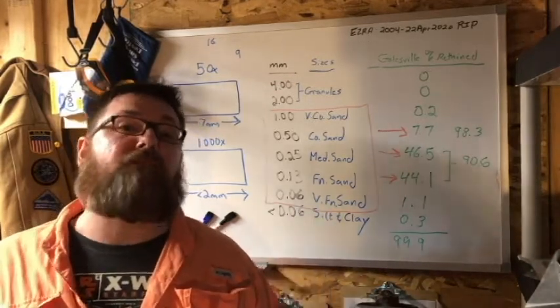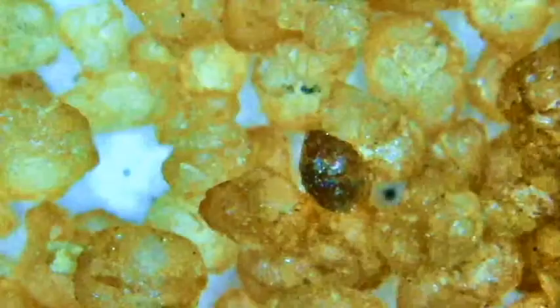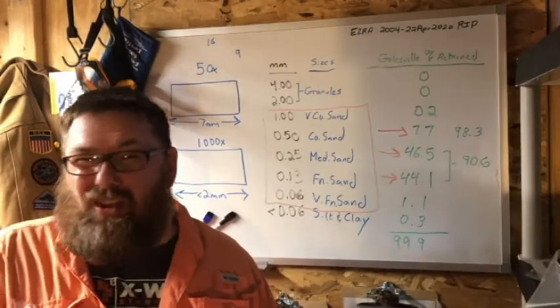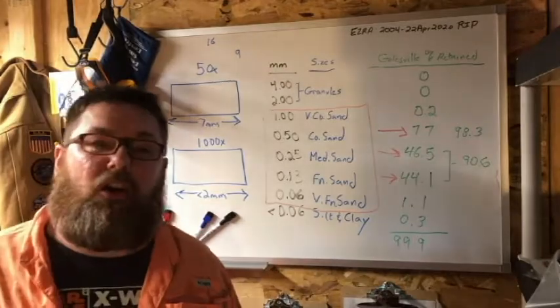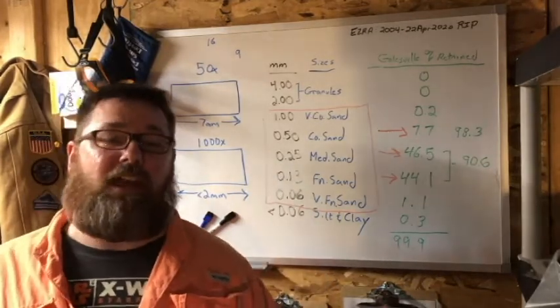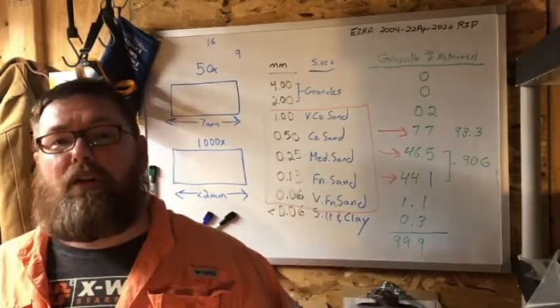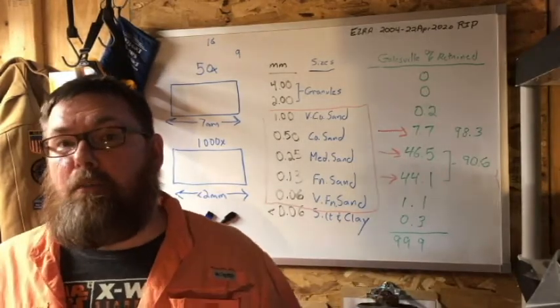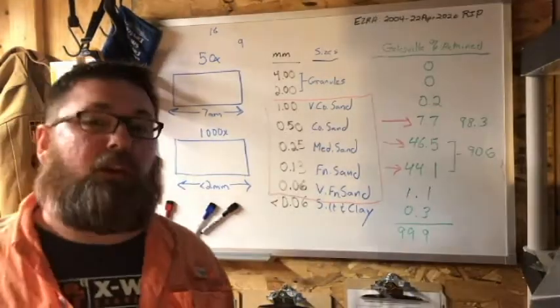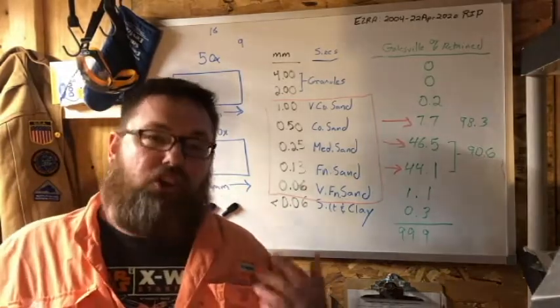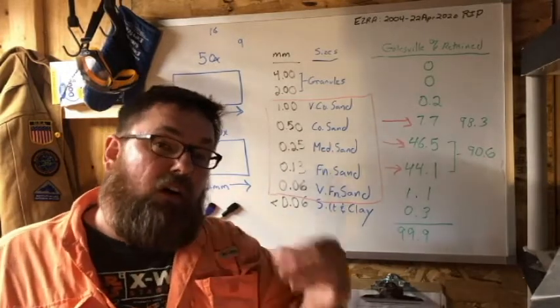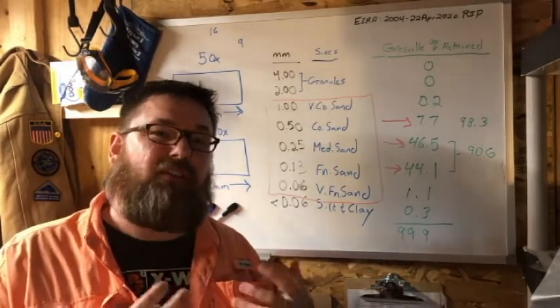There is some feldspar. You have a couple pieces that will appear either as translucent dark gray or as translucent reddish color or brown color—that's feldspar, not likely quartz. So this thing is a clean quartz arenite. There are almost no lithics—you'll be hard pressed to find any. I didn't see any in this example.